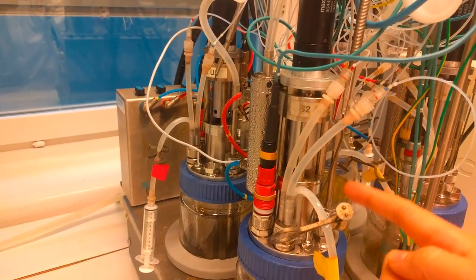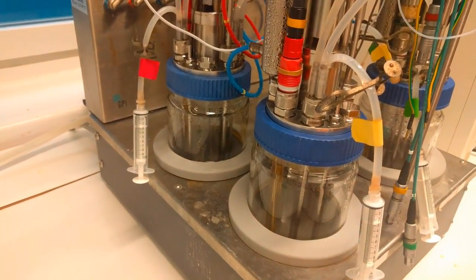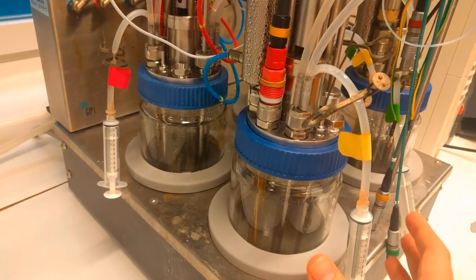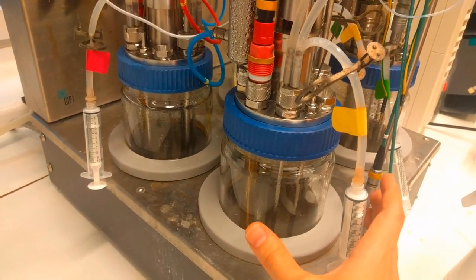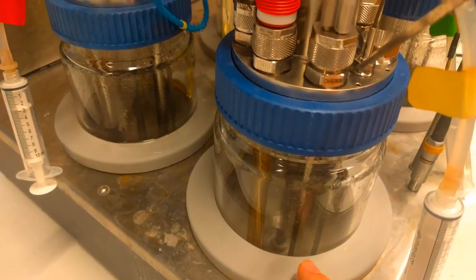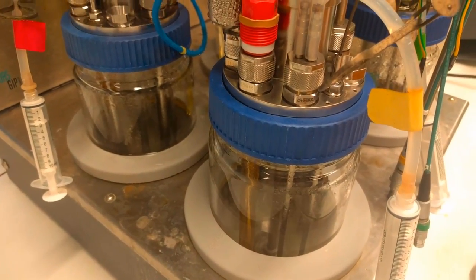Next thing to point out is the temperature probe, which is going in here. That's our digital thermometer, which is going to tell us the temperature and make sure that our reaction stays at exactly the temperature that we designed this experiment to be at. That's going to be heated by this block that sits around the vessel itself. We're keeping the temperature controlled with that block.